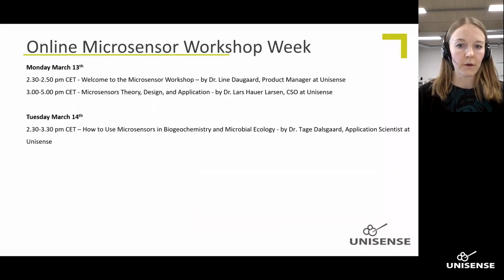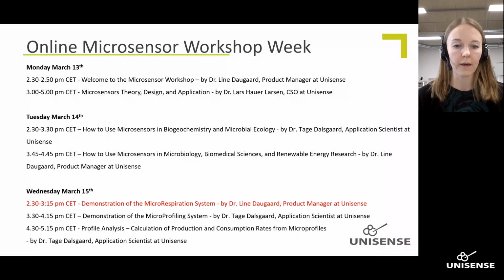Today, Taya and I have moved to the lab, and we will do demonstrations of the microprofiling system and the microrespiration system. So I will just share my slides here. We are here on day 3. I will start with a demonstration of the microrespiration system, and then Taya will do a demonstration afterwards of the microprofiling system, followed by a presentation that shows you how you can analyze the profiles. So this is the program for today.